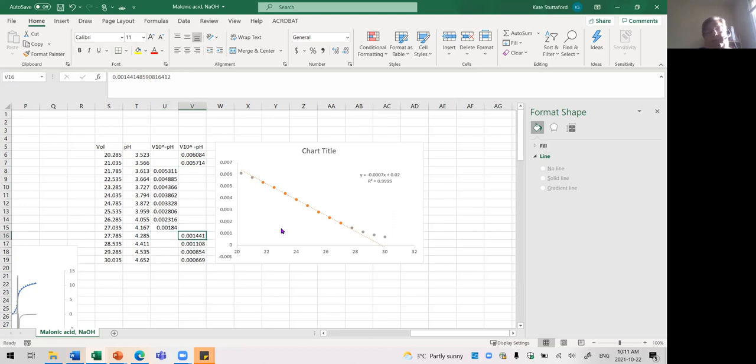And so I'm eyeballing the line where the data is falling relative to the line, and that R squared value. So there are a bunch of different parameters we're looking at here. We want the points to be on the line. We want the gray points to be obviously not on the line. And again, this one is maybe a little bit debatable. This last one, it did improve the R squared slightly when I took that off, and it went from 0.999 to 0.9995. But I think that looks pretty good. And I don't want to have too few points actually on my line.